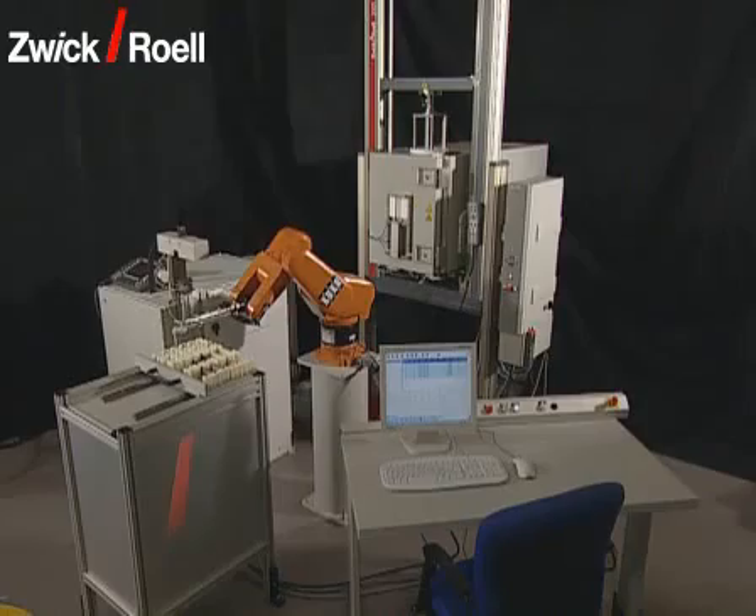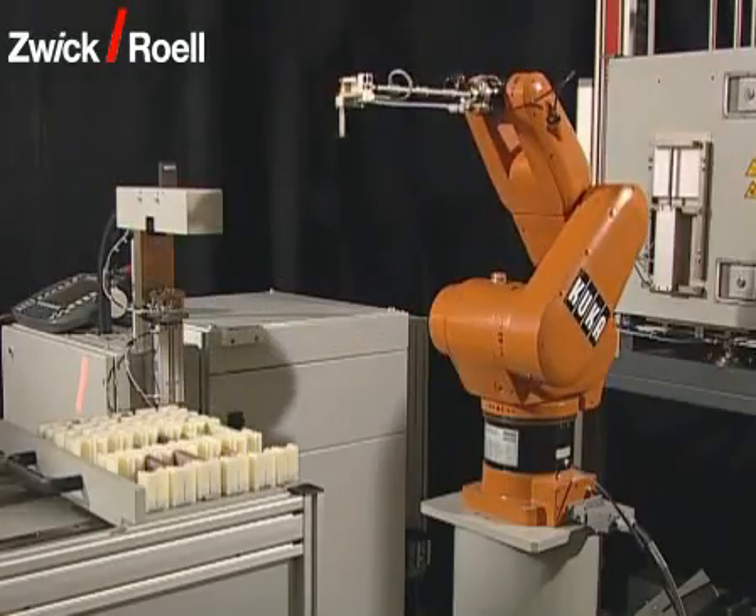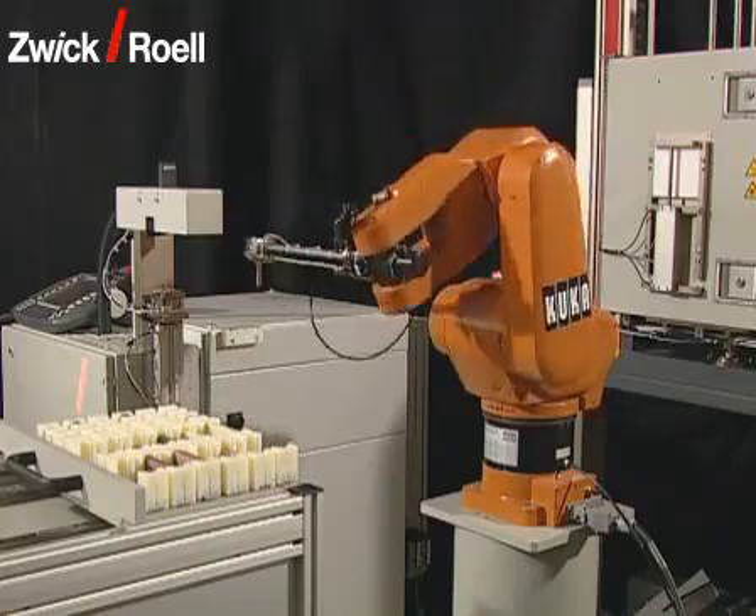The Fully Automatic Polar Type Testing System has been designed for the running of bending tests on specimens of composite materials.